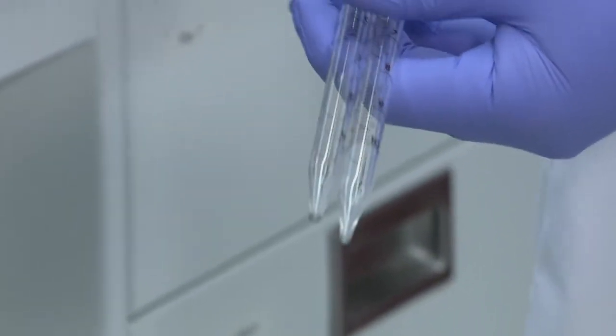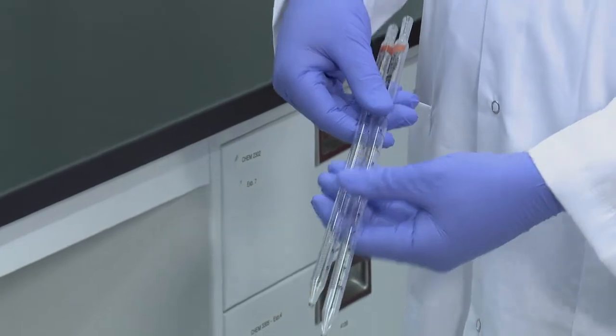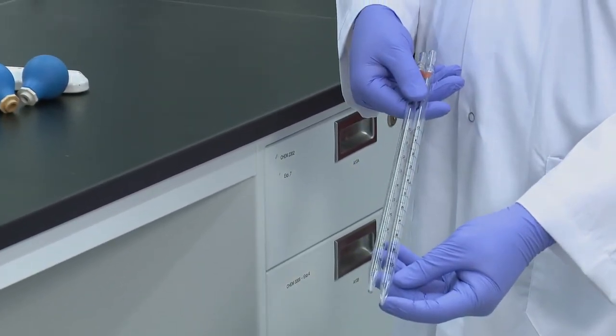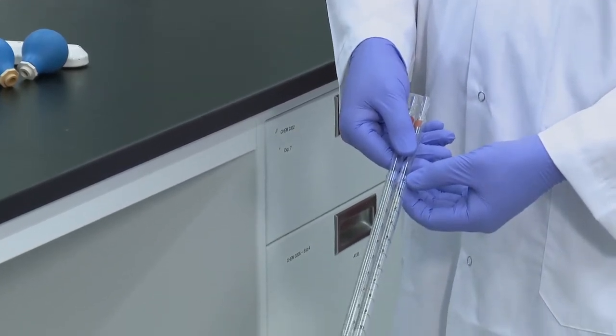This pipette is intended to be emptied from whatever line you're at to the very bottom. On the left we have a Mohr pipette where the bottom part is uncalibrated. So to deliver 10 mL in this pipette you would go from the zero line and stop at the 10.